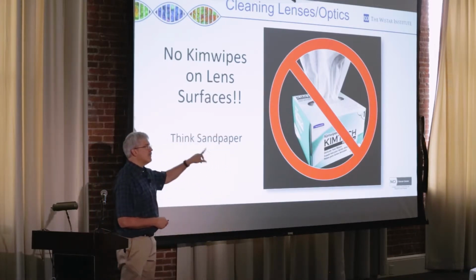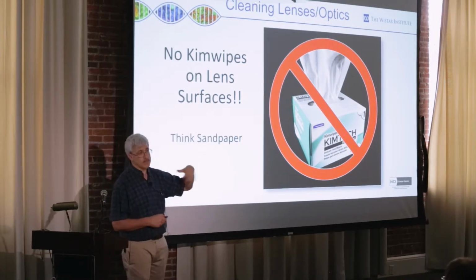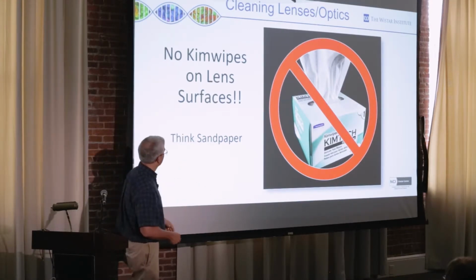So you never use Kimwipes on any microscope glass. It's okay on slides generally, because you're only using them once or twice and there are no coatings on them.